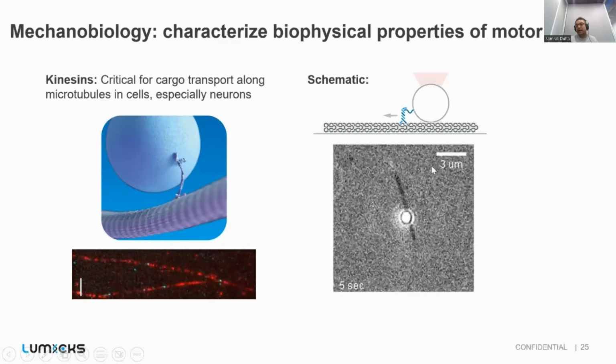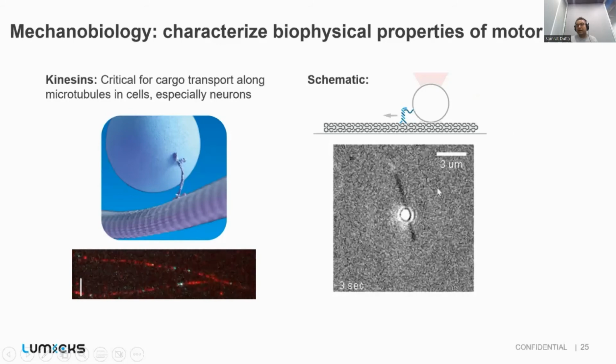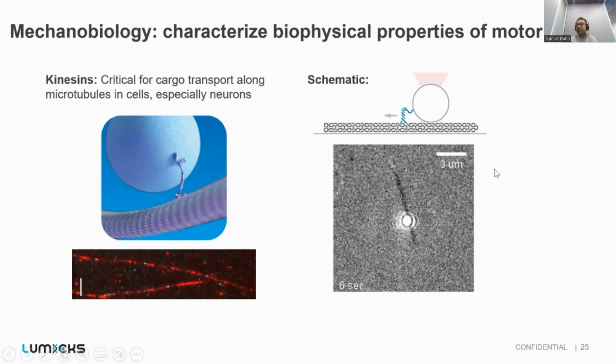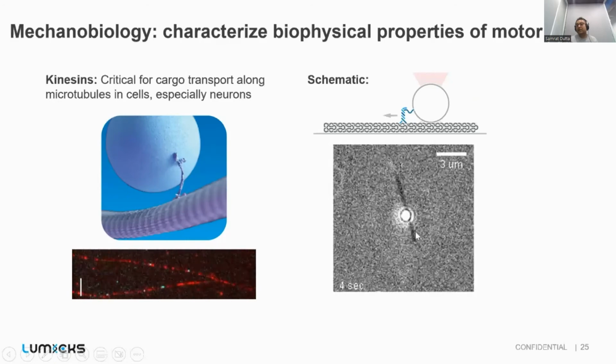This is an IRM image, which means interference reflection microscopy. This is a label-free technique which does not require any kind of dye, and this can be combined with the optical trap and the C-trap. As we can see here, the fluorescent bead is nicely walking on the microtubule.